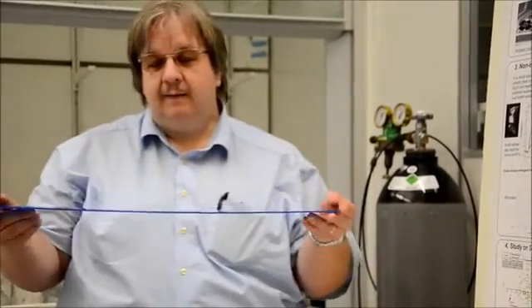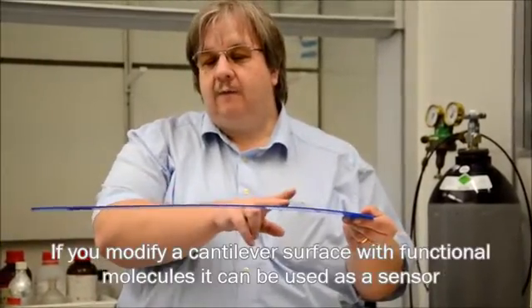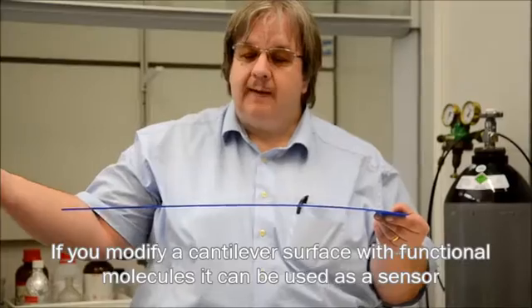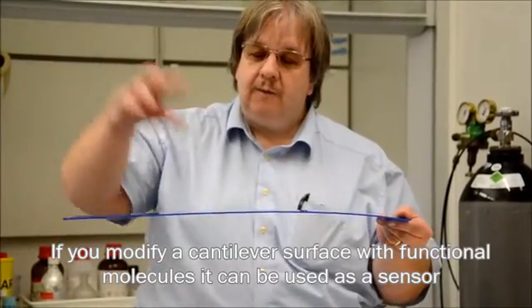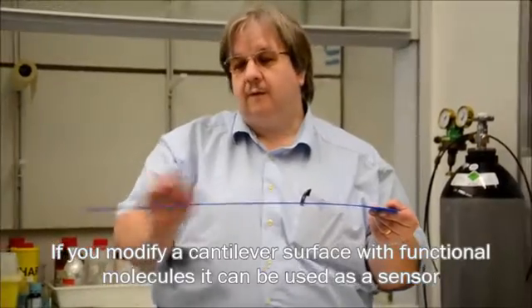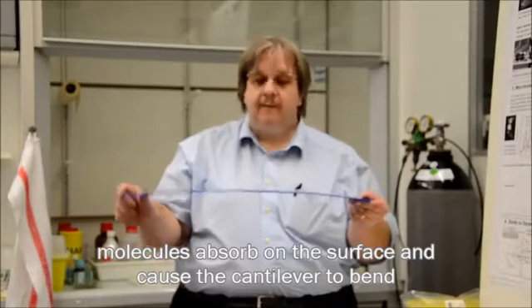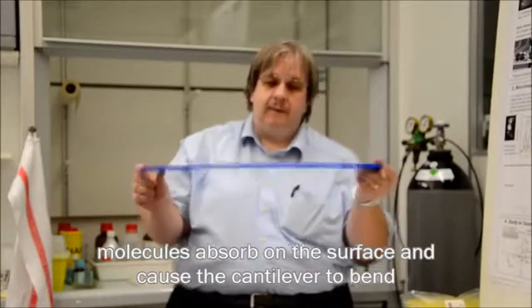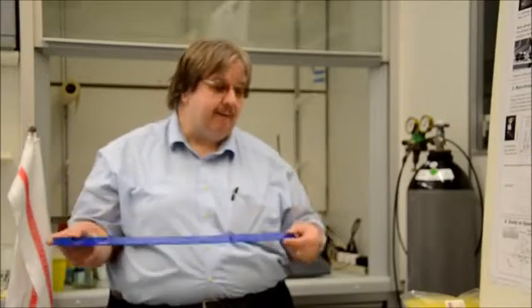If you take such a cantilever and modify its surface, then it can be operated as a chemical sensor. Molecules will absorb on the surface, and this produces bending of the cantilever. This is our sensor signal, so we can operate these cantilevers also as chemical sensors.